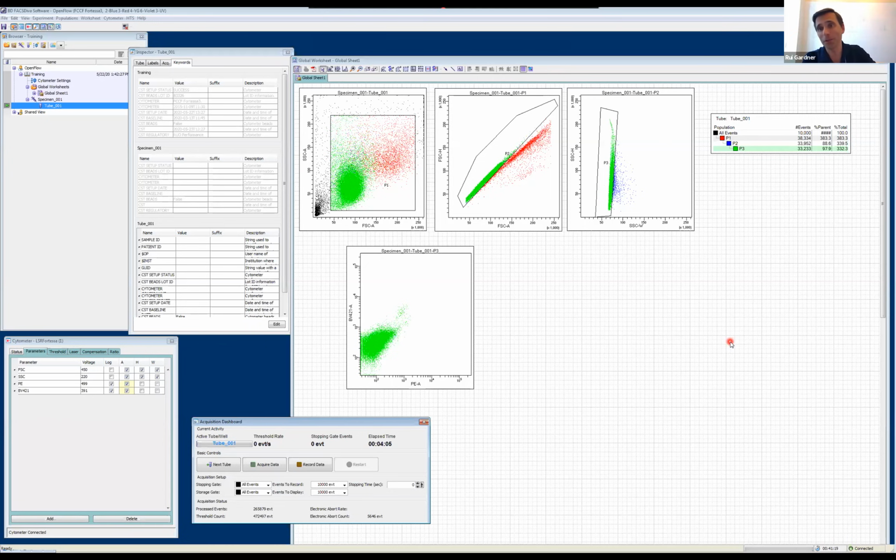Okay, so we have a lot of questions here, and I think this is important. Although we're running a little bit late, these are really relevant questions that people ask all the time when they're doing cytometry, even the more experienced. So somebody's asking about area scaling. This is something that we debated, the three of us, whether we would go into details or not. So we won't go into details now, but we'll address this question offline, and we may be getting back to this in a future webinar.